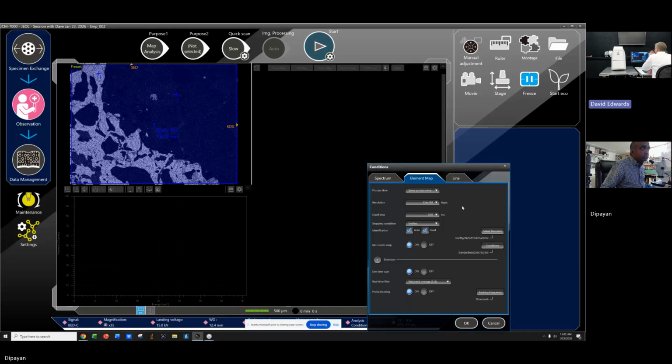we are, let's see, I got to read your screen. Authentication. Here, select elements. No, that's not it. Sorry, I'm going to pop up my own window. I got to remember what I'm doing. It's been a while. That's okay. And let's see. Data management.